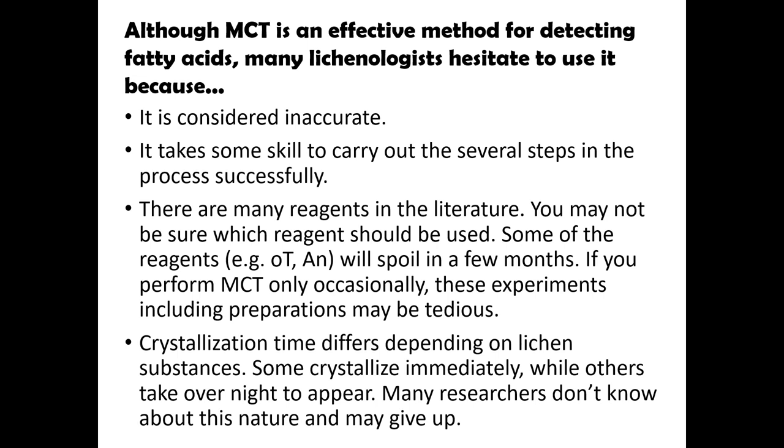If you perform microcrystal tests only occasionally, these experiments, including preparations, may be tedious. Crystallization time differs depending on lichen substances. Some crystallize immediately, while others take overnight to appear. Many researchers don't know about this nature and may give up.